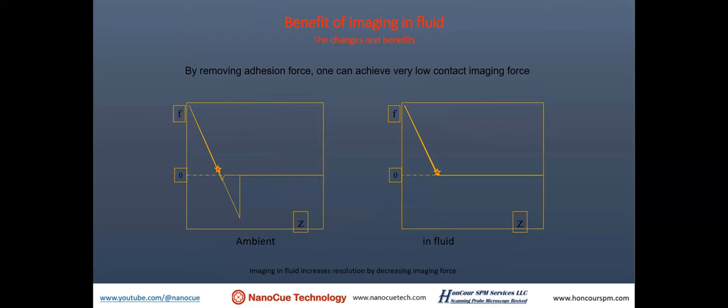Now, there's benefit of imaging in fluid. Here, what I drew are two force curves using contact mode on a sample in liquid compared to in air. When you do a force curve in air, you often observe a relatively large pull-off force. This force is what we call the capillary force. Capillary force is a force of attraction between the tip and sample caused, we believe, by the condensation of water molecules on the surface of a sample. Sometimes even a single molecular layer could cause a strong capillary force or adhesion force.